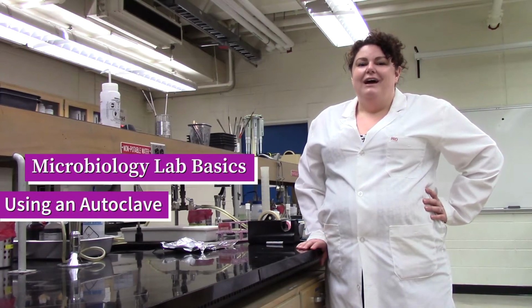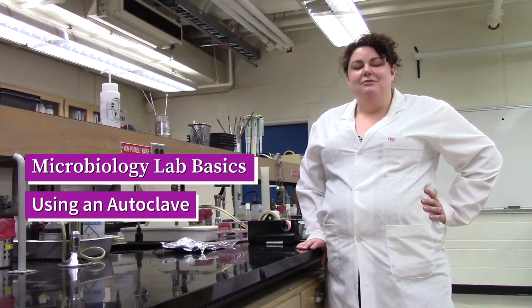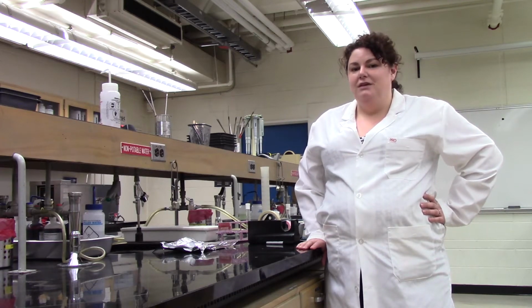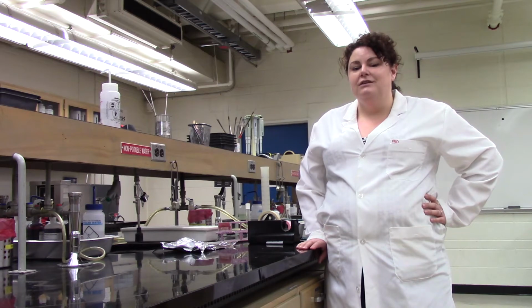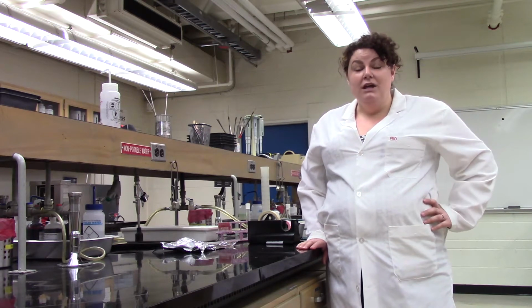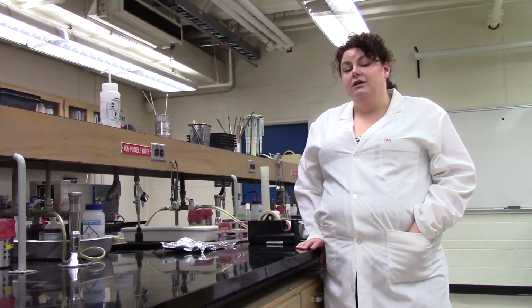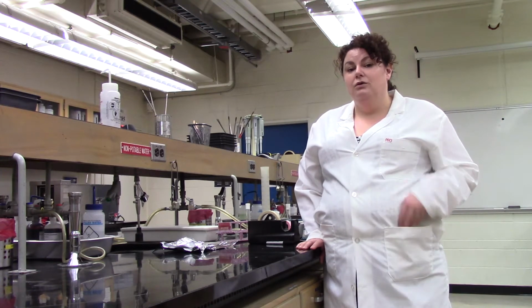Hi everyone. You've already heard the theory about how an autoclave works, and now I'm going to walk you through some of the basics of using an autoclave in the lab. Before we even go and look at the autoclave, I want to make sure that you've got a little bit of background about what can and cannot go into the autoclave, and also how you need to get something ready to go into the autoclave.